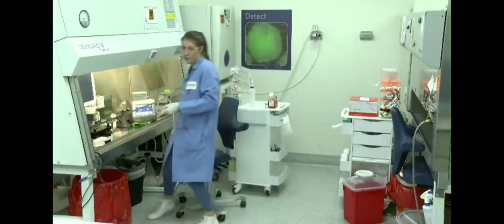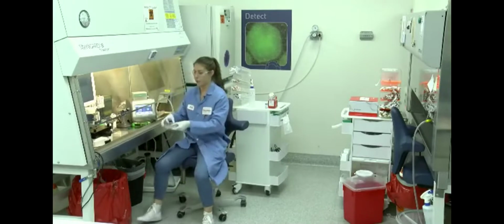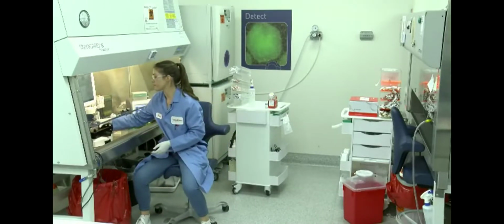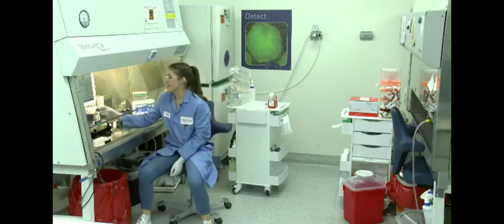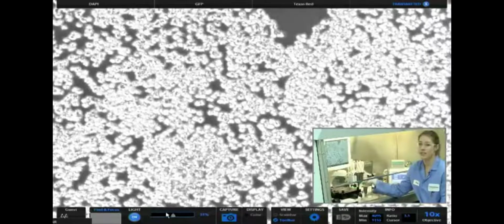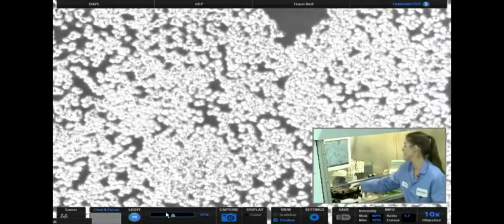You can check to make sure that your cells are starting to lift off the plate by looking at them under the microscope. You can see that the cells have started to round up and they look like they're starting to lift off the plate. That's a really good sign, and your cells are ready to harvest.